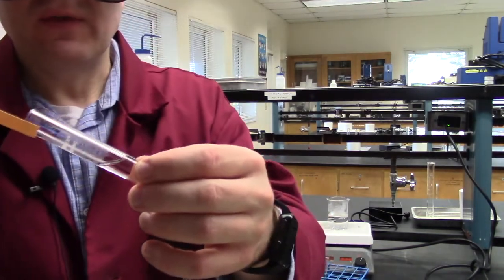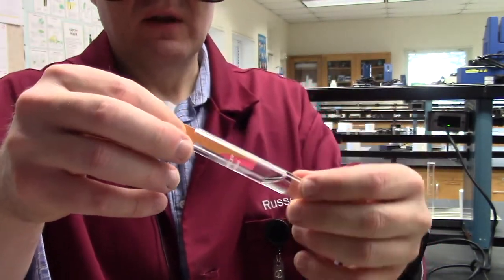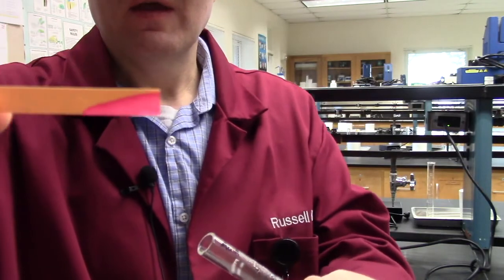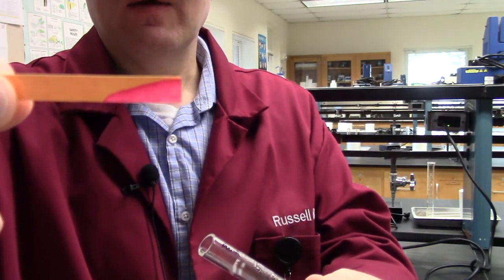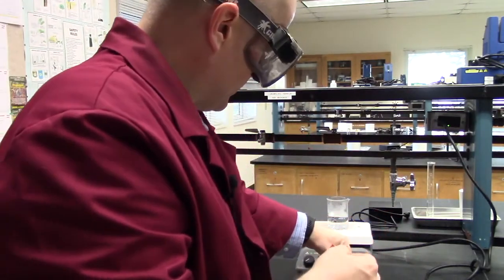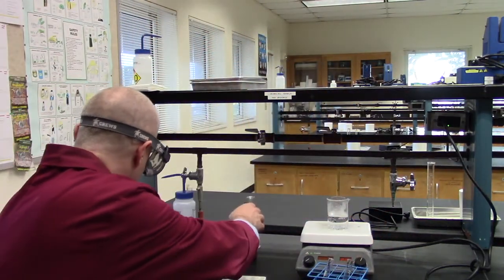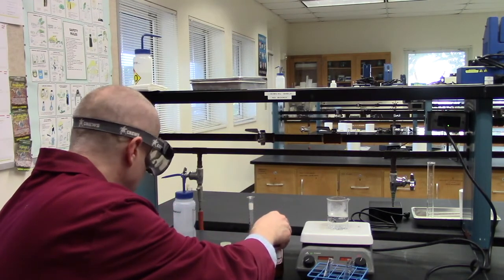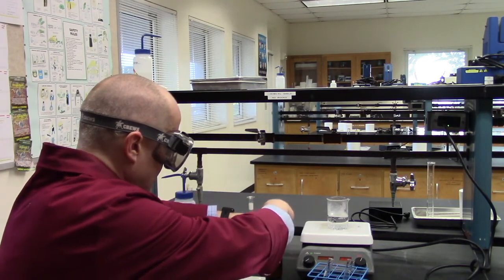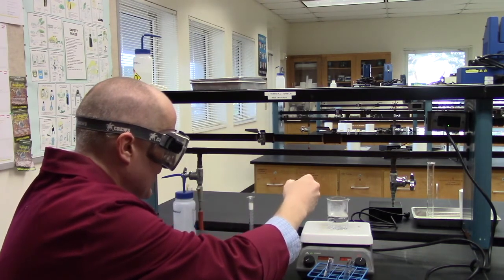Now this most definitely, just let me get on frame here. This most definitely should be acidic, right? Because we added acid to it, right? And there, as you can see, it's red. Red is right around pH 2, just so you know. So this is acidic. So now I'm going to add some sodium hydroxide to counter that, to make the pH come back to about 7. I'm going to add a couple drops. It says in the book to add a ml. I'm just going to add a couple drops. See what happens.